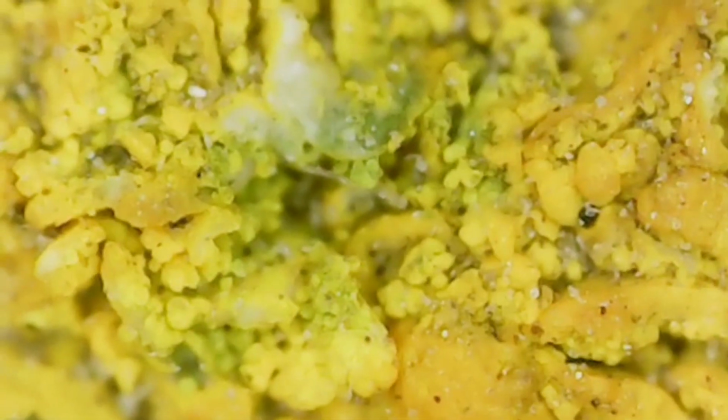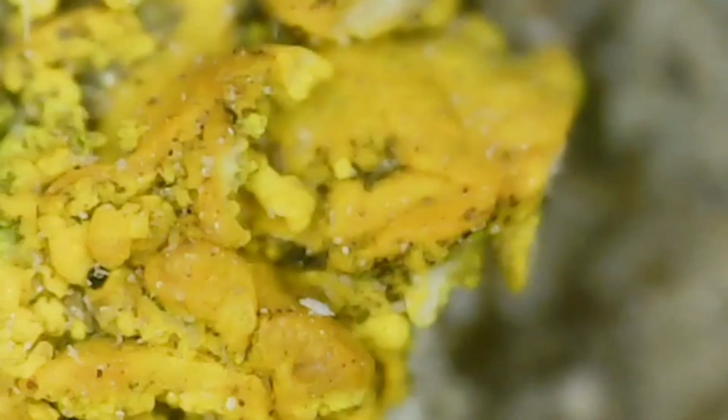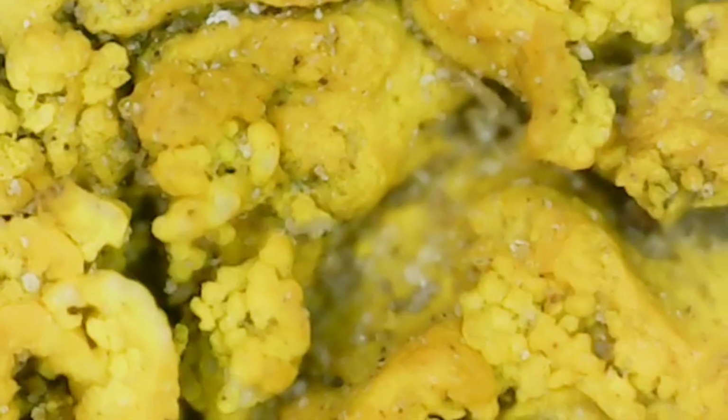Okay, we're now looking through the portable microscope on the surface of the oak tree, specifically at the lichen community. Here is a close-up of the oak bark, and then the lichen community itself. It's a pretty close mutualism between the algae and the fungi, so an interspecific interaction. You can see the green bits, which are the photosynthetic algae, and the yellower bits are the fungi.